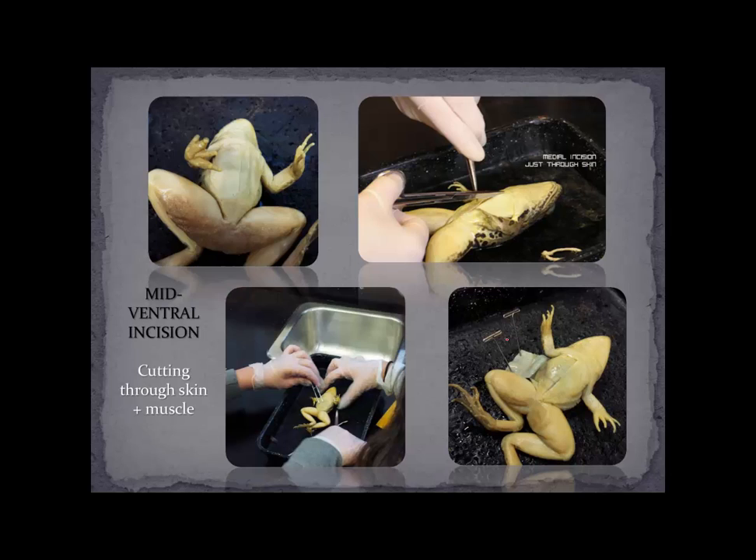So it's time for our actual incisions. You're going to be making a mid-ventral incision, laying the frog on its back in the dissection tray. The back is the dorsal side; the belly region is called the ventral side of the frog, and you'll be making an incision up the middle — that's why it's called a mid-ventral incision. I suggest doing this without any pins in the forelegs or hind legs, because as you move the frog around and make the cuts, there's a chance the pins will come out. Make sure you're wearing your safety glasses and gloves.